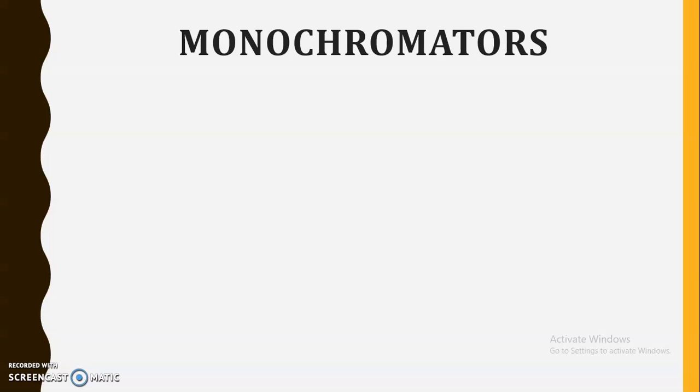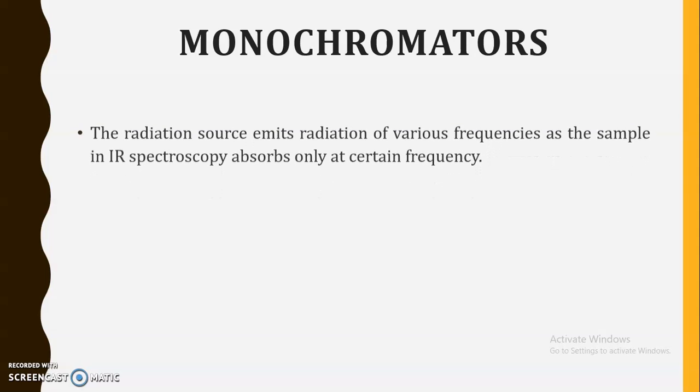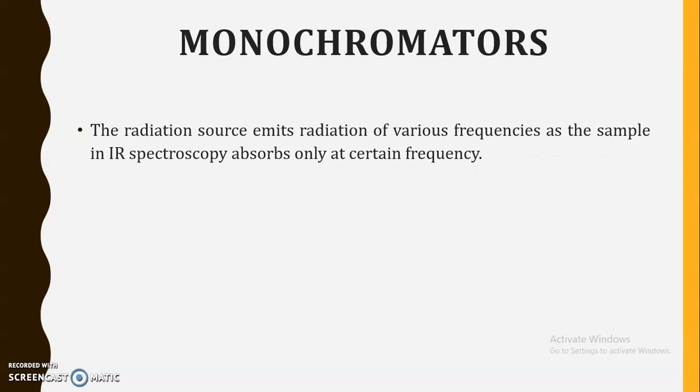Now the next important component used in the IR spectrophotometer is the monochromator. A monochromator consists of a series of mirrors as well as prisms or gratings, which are used for the separation of polychromatic light into its individual components. The radiation source emits radiation of various frequencies, ranging for example from 4000 to 400 centimeter inverse. As the sample in IR spectroscopy absorbs only certain frequencies, there is a need to use monochromators, which allow only light of certain frequencies to pass.